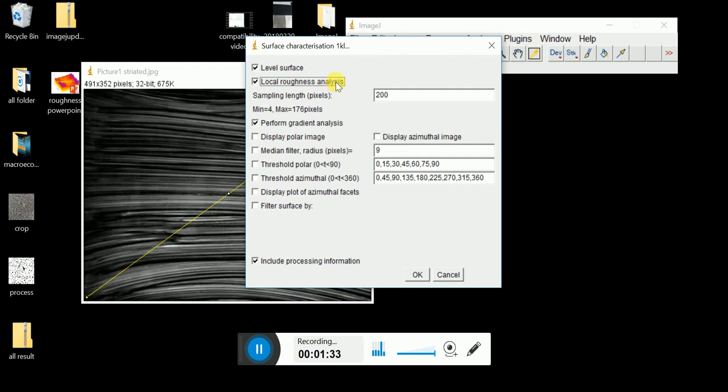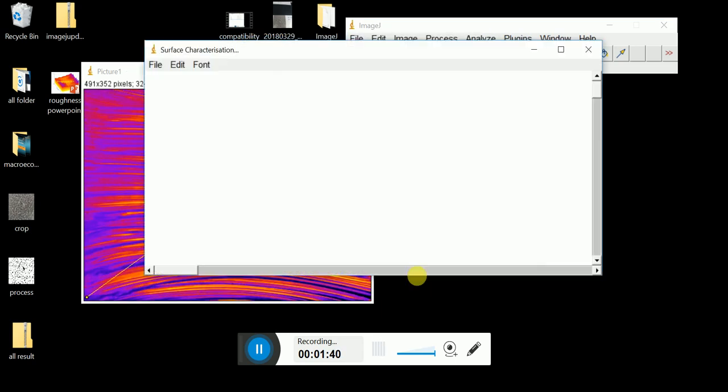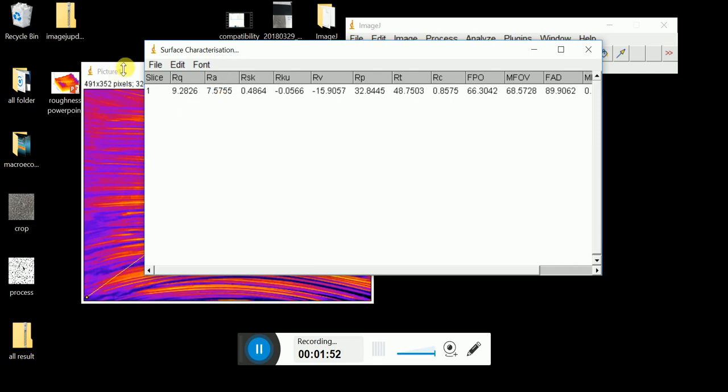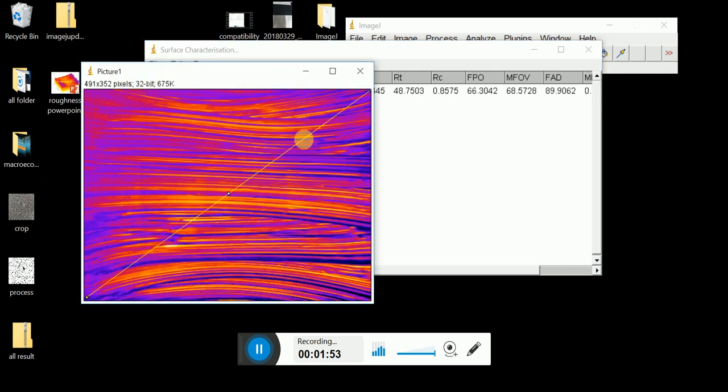In our case, we will put 100 pixel. Click OK. RA Right Value is our Roughness Value. So from here you can see that our RA is 7.5755. So this is how rough our area for this sample is.